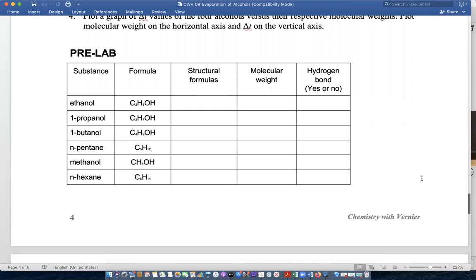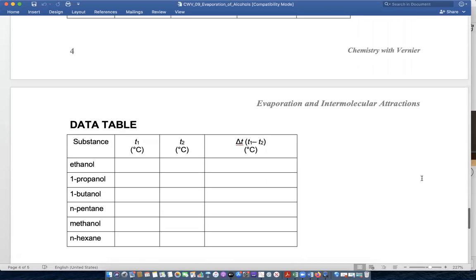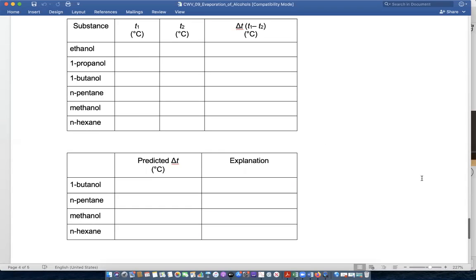Where do you get the teacher notes so that you don't have to try to look all this stuff up yourself and you know what to expect for that?